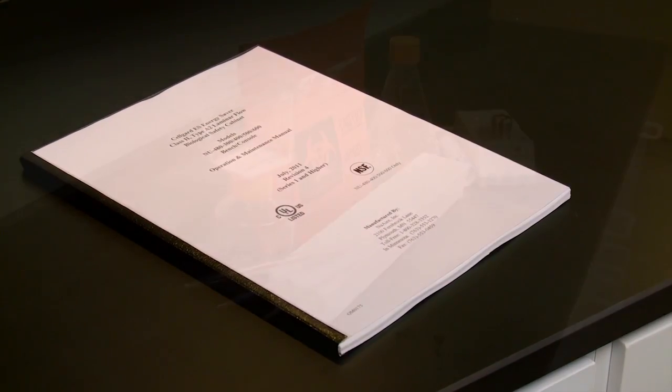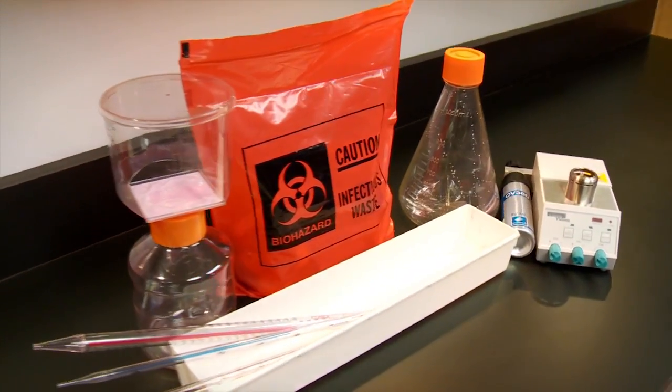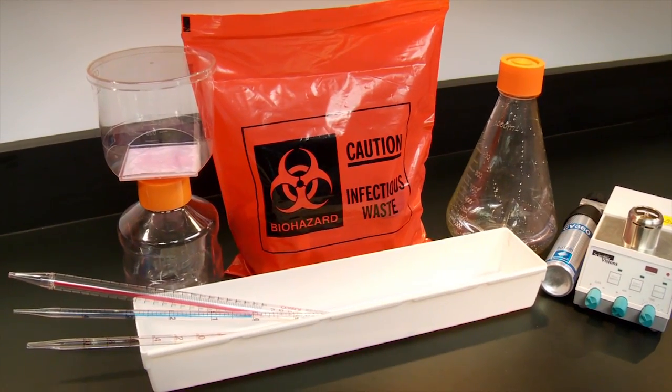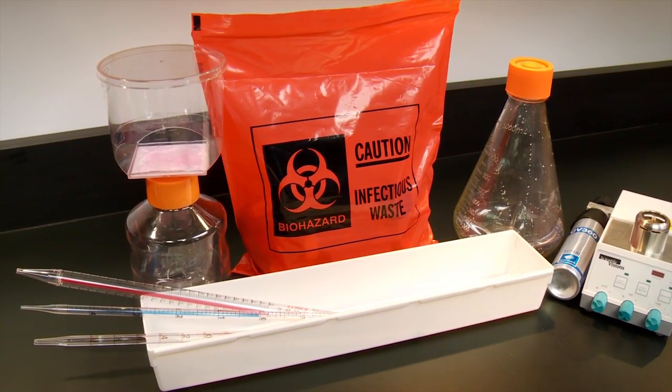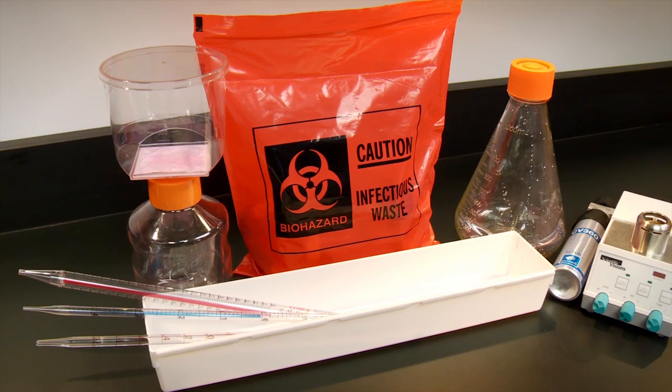Each laboratory should develop or adopt a biosafety operations manual which identifies the hazards that will or may be encountered and specifies practices and procedures designed to minimize or eliminate risks.